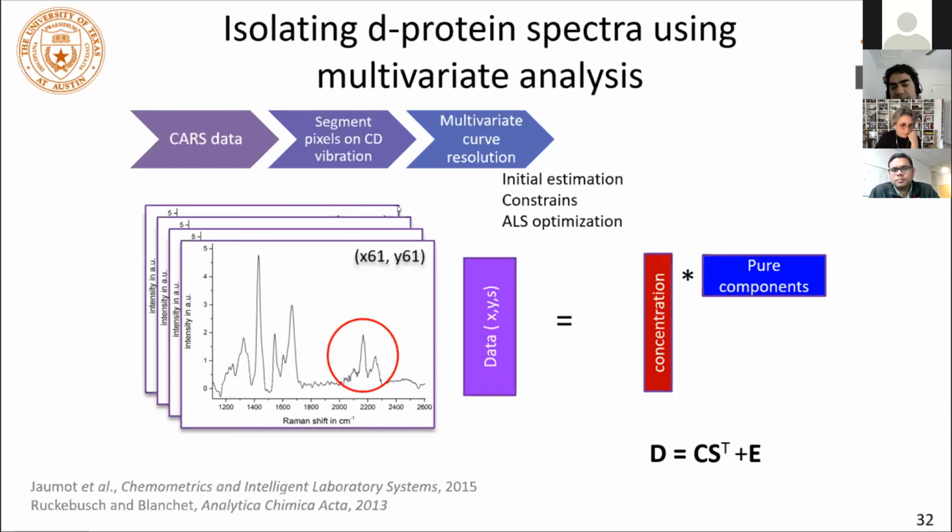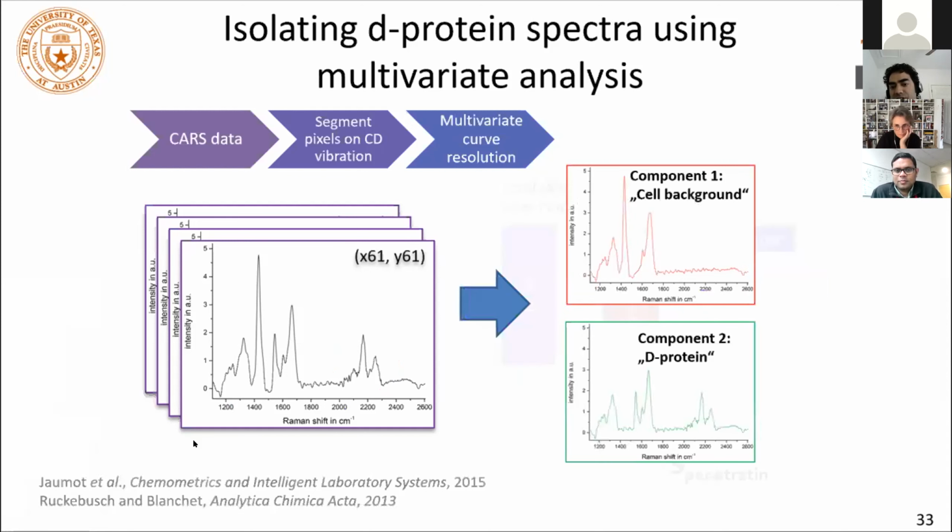What this does, on the other hand, rather than a matrix decomposition, is curve fit each of these spectral components, both their shape and how much they contribute in all the spectra that you have. So it's doing an iterative curve fitting for each of the spectra and minimizing the chi-squared error on the reconstruction that it produces. In doing so, it just so happens, and I can't explain why, that the deuterated part comes with the deuterated protein that I added. So they are spectrally reconstructed appropriately, versus the part that is not deuterated, which does not have that same shape. It's a good problem for deep learning. Sapun, it's an outstanding problem for deep learning.